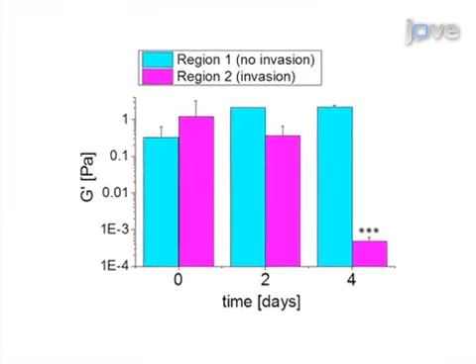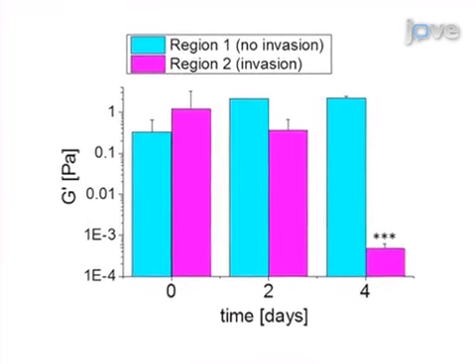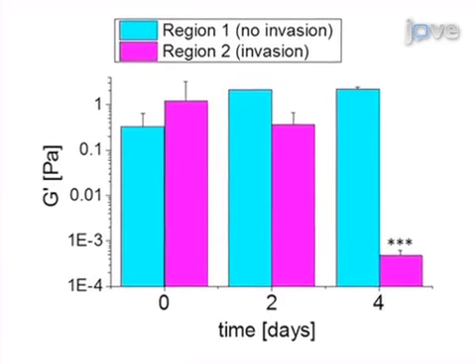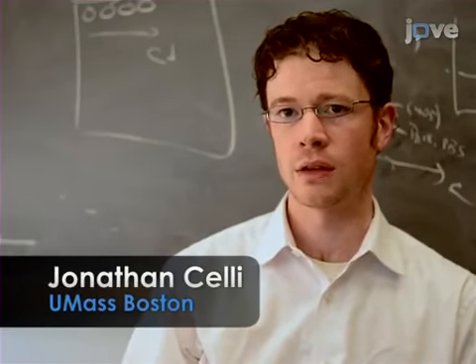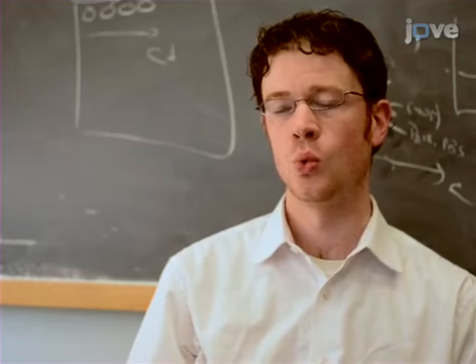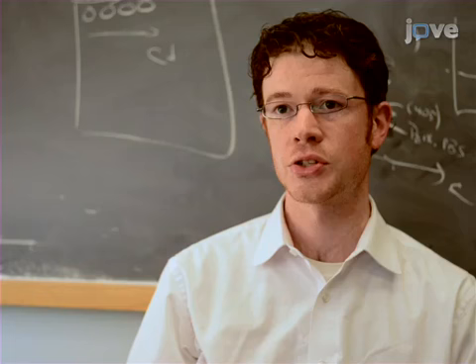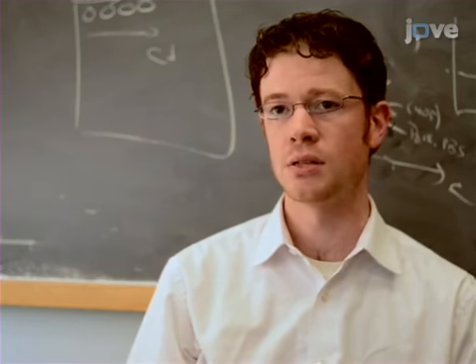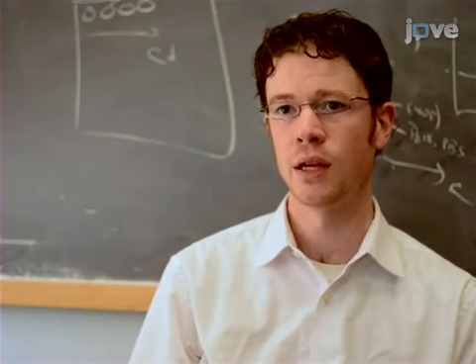Ultimately, this protocol uses analysis of tracer probe trajectories to longitudinally quantify spatial changes in extracellular matrix mechanics in a non-destructive manner. The idea is that by bringing together imaging-based measurements of extracellular matrix rheology with in vitro 3D tumor models that restore extracellular matrix interactions, this approach can provide quantitative insight into time-dependent changes in the mechanical microenvironment that accompany tumor growth, invasion processes, and response to treatment.